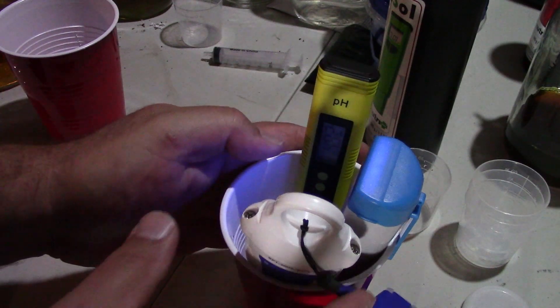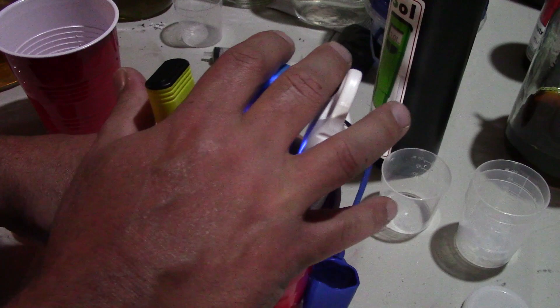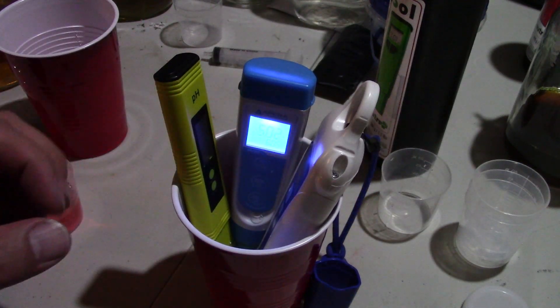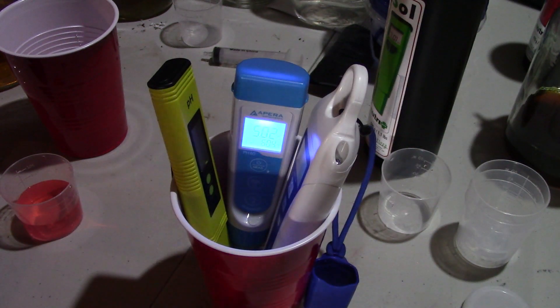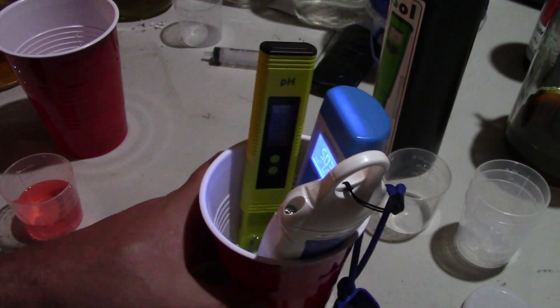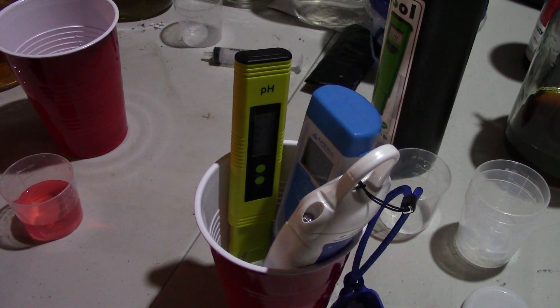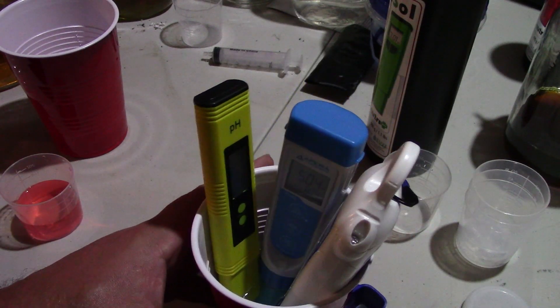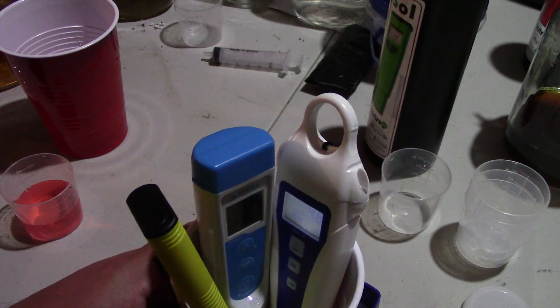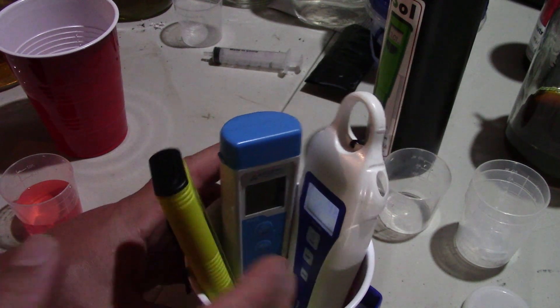Let's just jump up. Let me give these a shake — a little bit of a shake here and then let it stabilize. So that one's 5.02, this one's 4.8, and this one is 4.96. So, three different pens, same solution.